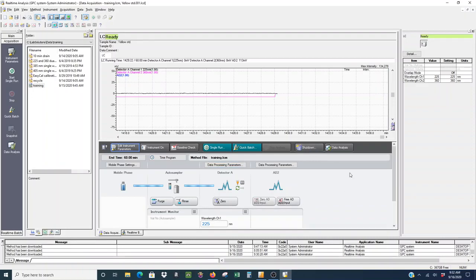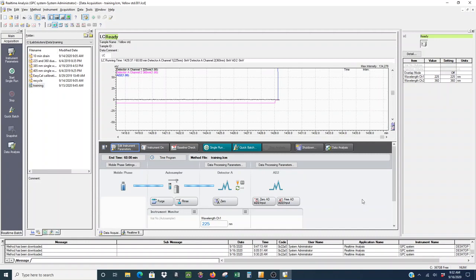This probably won't work right now because our RI detector does come down, but it will drift back up. It's really struggling. It's not having a good time right now. So just focus on UV for now.